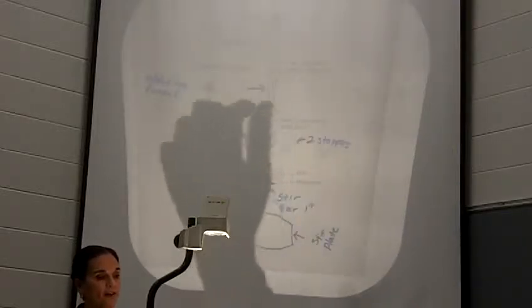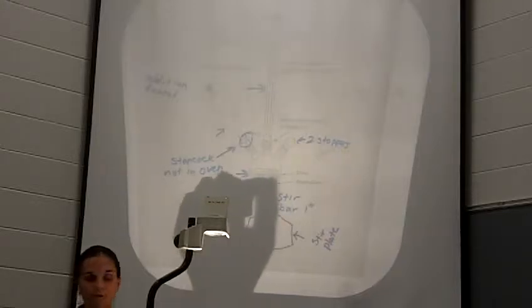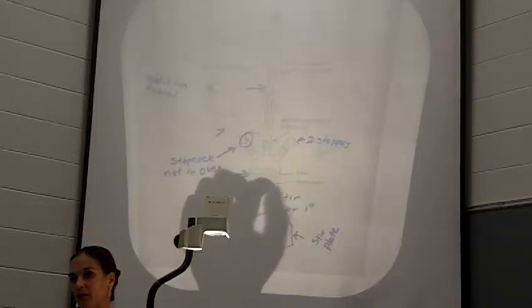So once you have this all set up, you're going to have magnesium here in the bottom. Now what does magnesium look like?